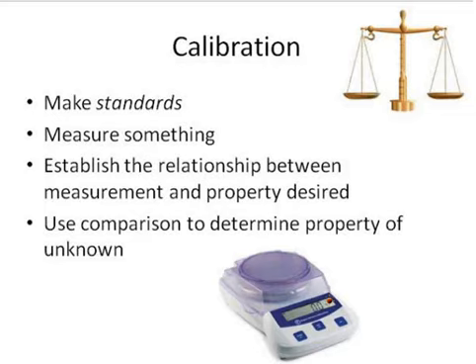And one of the ways that it changes over time, I should point out, is that things get dirty. So be very, very careful when you're weighing stuff on the analytical balances and the balances that are in the labs to keep everything clean. Be very conscious of not getting minuscule amounts of solids down inside of these balances, and they'll behave, and they'll be very, very useful devices for you in the future. They're extremely accurate and precise, very good measurements to use.